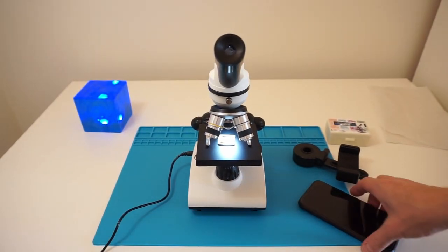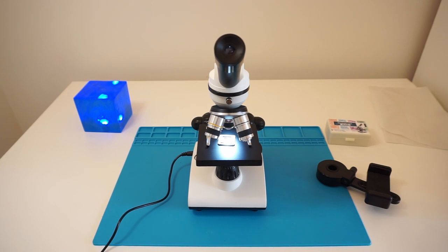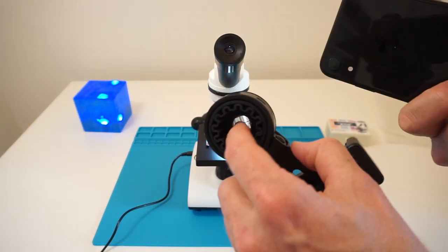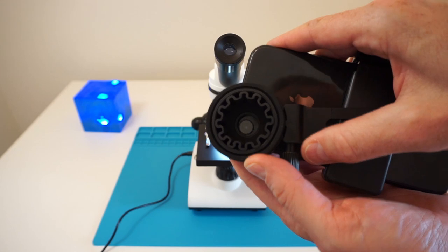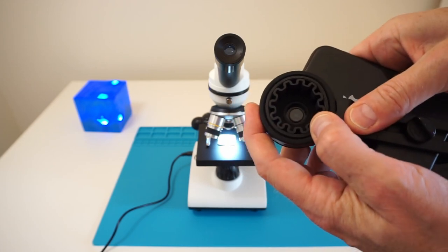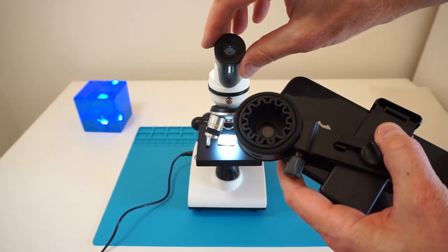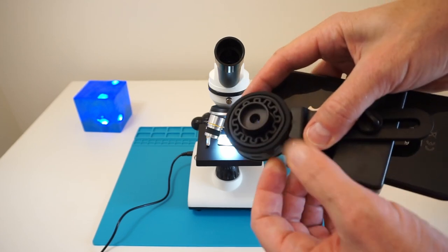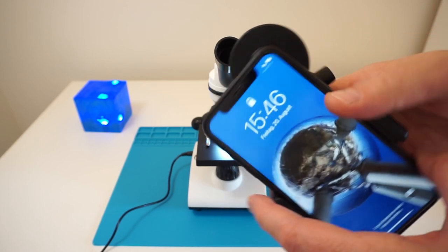But in order to do that, in order to show you the picture, I will use my iPhone and first show you how to fix it to the adapter. Well, it's pretty straightforward. You have to align this hole here with the lens. So I have already tried that. If you now would align that in the best possible way. So step one managed. Here you have a couple of rings, and the rings are matching with the eyepiece you are using. So I'm putting the eyepiece in here and I'm tightening it as of to have some kind of a holding.